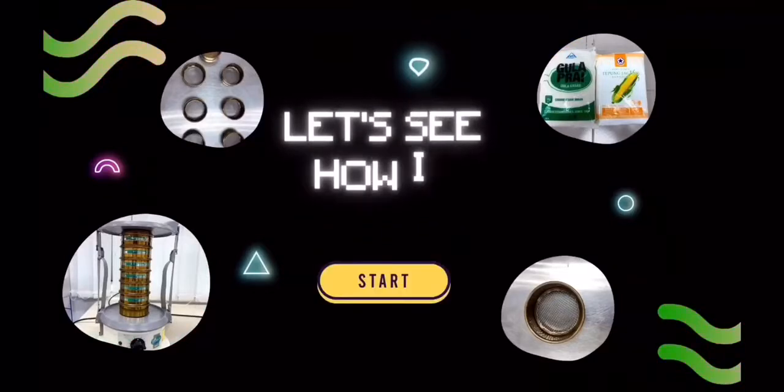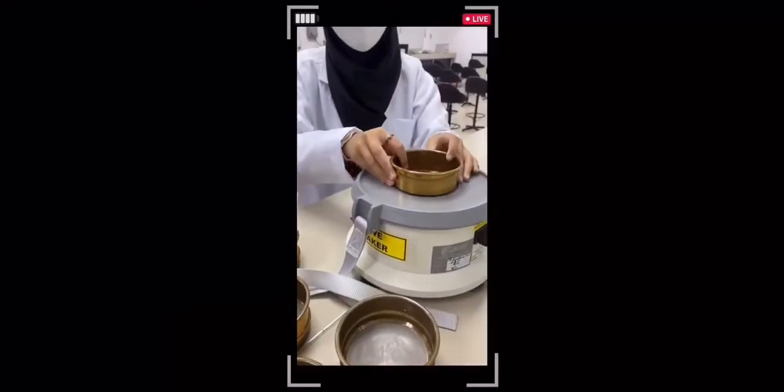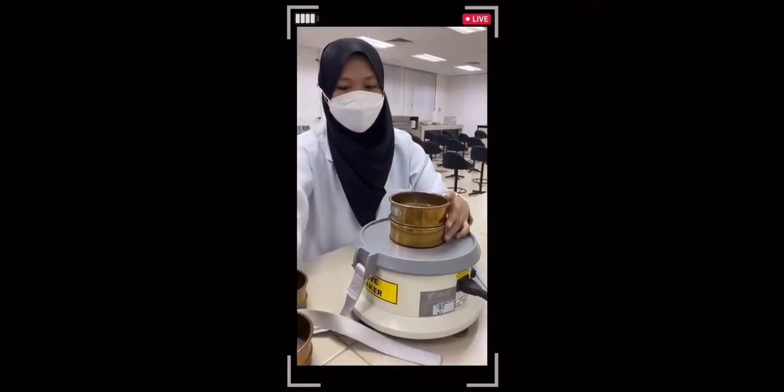Now, let's see how it works. First, arrange the sieve according to its diameter. The diameter decreases from top to bottom.